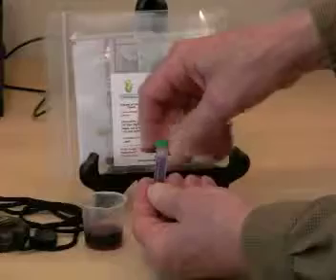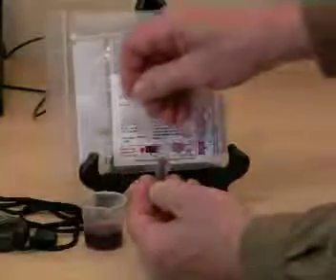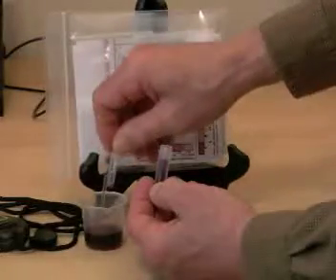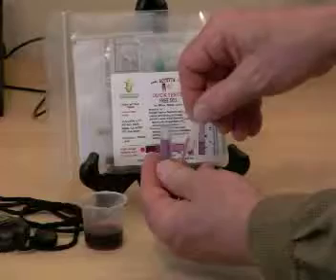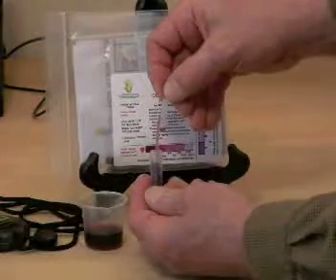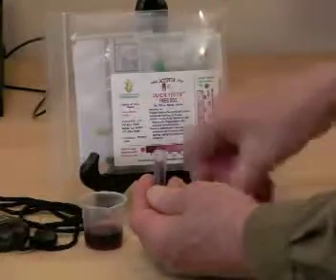We'll remove the green cap. We'll pick up the sampler by the top bulb, squeeze once, place the tip into the wine sample, and release. The sample is contained in the straight portion. The overflow bulb contains excess sample. We'll wipe the outside of the tip, place the tip into the reagent tube, squeeze once, and remove the sampler before we release the bulb.